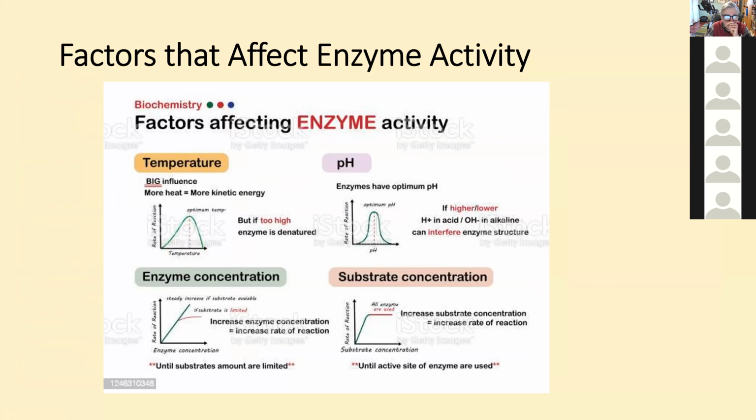Now, in the lab document we used to have students make a hypothesis as to how do you think temperature is going to affect enzymes?